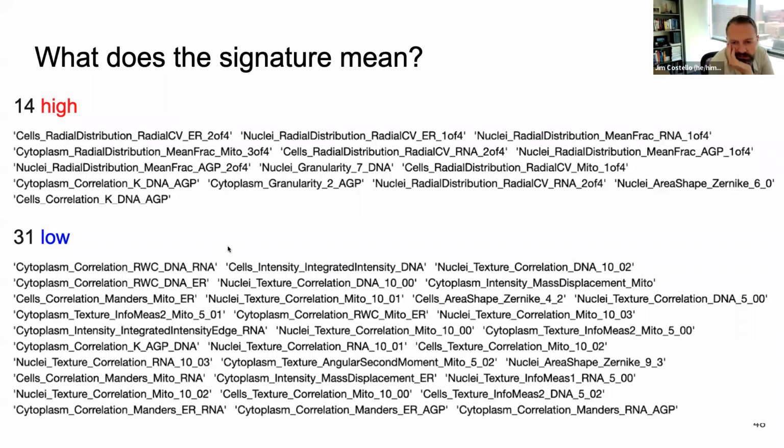But it's more, I guess, to extend that thought, it's more about the combination of these features and trying to interpret what that means. Is that what you mean, Greg? It could be, yeah. That could be part of the solution when trying to interpret these features. So it might not be worthwhile to look at one of these features independently. I mean, we know that in every data set that we analyze, these features are very strongly correlated with one another. So they're likely reporting on similar aspects of biology. And there's likely some nuance as you go data set to data set.